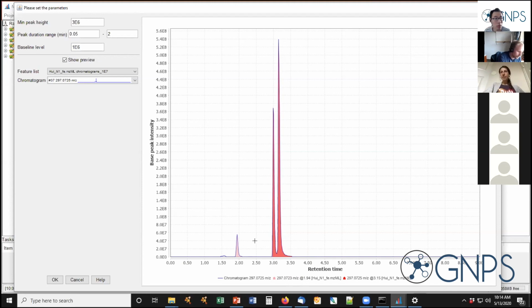Hey Daniel, maybe we can show them an example of doing local minimum search as well. Yeah, that's exactly what I want to do now. I guess one of the reasons we went with this was just because it's the simplest and the quickest. Yes. So for people unfamiliar, it's just the quickest. But since we usually do use the other ones, maybe we can just take them through that.